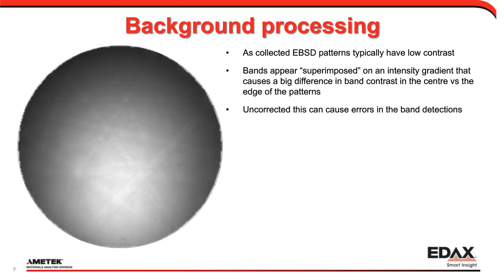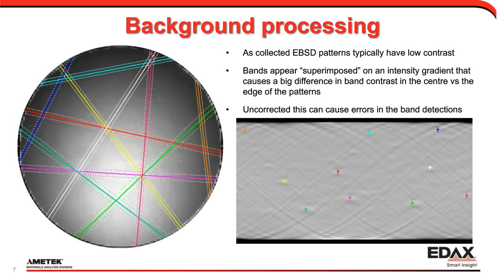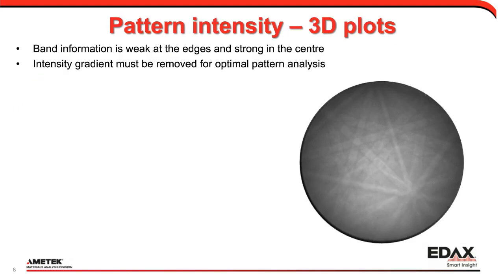Let's go ahead and take a quick look at this. Here is our Hough space. And there I can see these little peaks, little areas that stick out to me, but they're not very well defined. Now, if I go ahead and use those peaks, we can see here that I've found quite a few of those. But if I do a background on this, it can give me a little bit better idea of what it's doing.